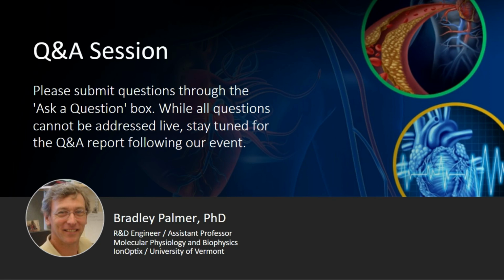When I say these cardiac slices are robust, you can expect performance from these cardiac slices that you would not expect from other model systems, like a whole heart. You cannot afford to keep a whole heart away from oxygenated solution for very long, but you can afford to do that with a cardiac slice if it's being handled properly. Yeah, that is amazing. Okay, that was a great response.